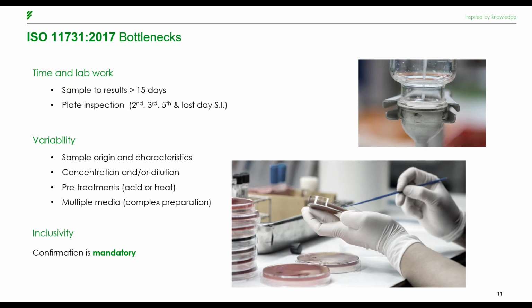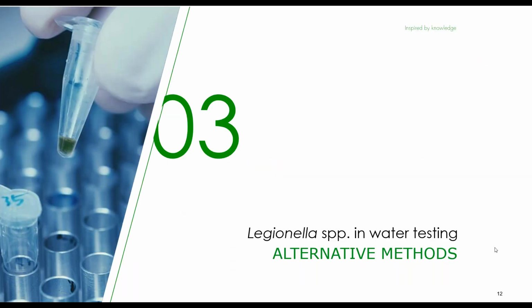Also, some Legionella cannot be grown on this media and are referred to as Legionella-like amoebal pathogens, which is rare. But finally, also the confirmation of the presumed colonies is mandatory, with a couple or several days of incubation.